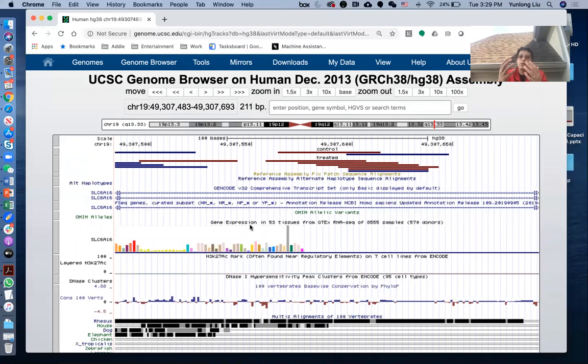But now you see, once we zoom in, you are seeing all these different bigger dashes. There are different colors. Red means this particular read is on the positive strand. Blue means it's on the negative strand. This is where the sequencing reads are. Remember that when we did the NGS experiment, we got millions of different reads. Each individual one is aligned back to the genome and creates this BAM file. So each individual row is a read, and each individual dash here is one row in the BAM file that tells you where those sequencing reads are.